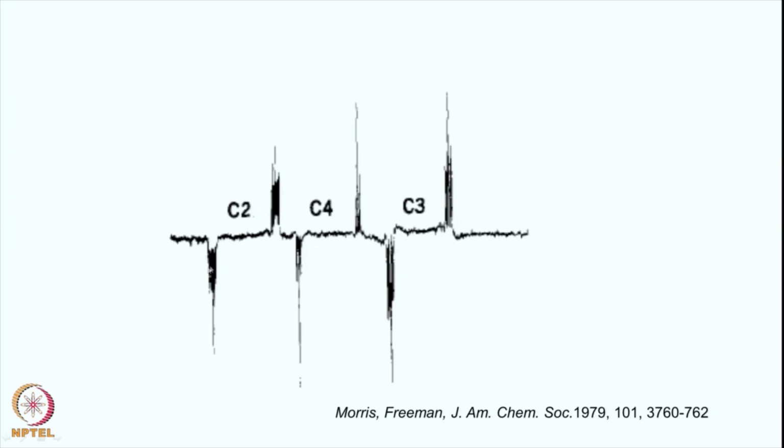So one here, this is negative positive, negative positive, negative positive, and of course you are seeing some fine structure here of some molecule. This is because of the carbon-carbon couplings, which also evolve during the detection period. So we have not done anything about the carbon-carbon couplings. Wherever there is a carbon-carbon coupling, it will lead to a splitting, and therefore the whole set here will contain these carbon-carbon couplings.